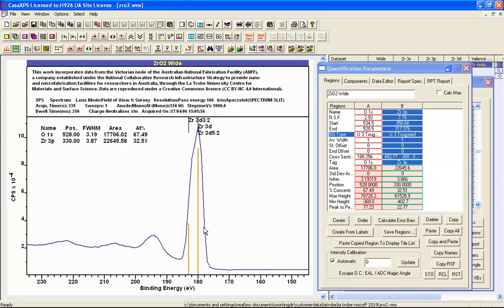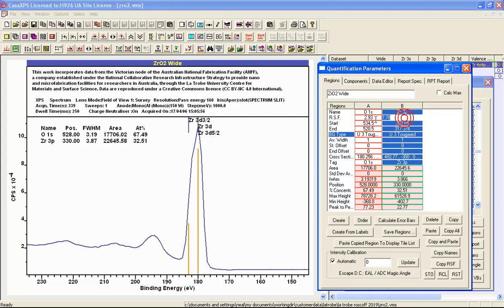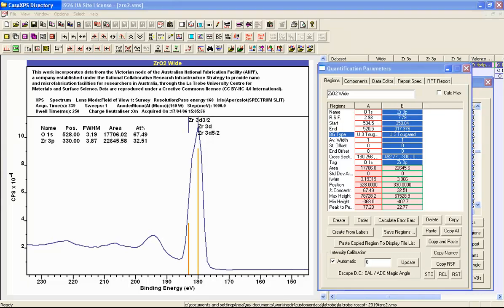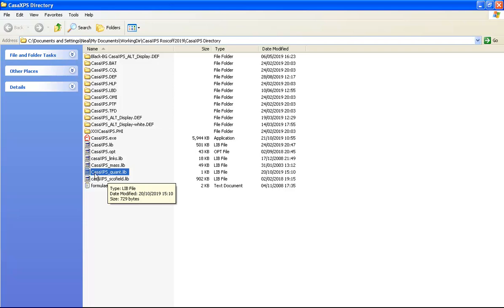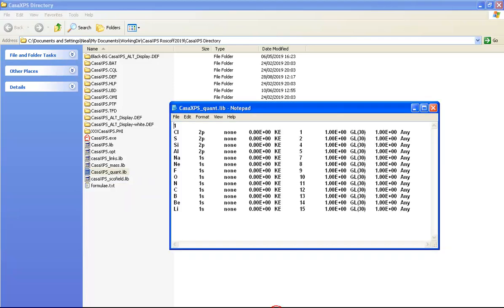Rather than adopting the convention of using the largest relative sensitivity factor, we can override this behavior by using a file that is within the CASA XPS directory to specify that we would like to use a different peak from zirconium 3p when we do automatic quantification. The file is called CASAXPS_quant.lib. It has the same format as a CASA XPS library but simply contains entries that are in that format.